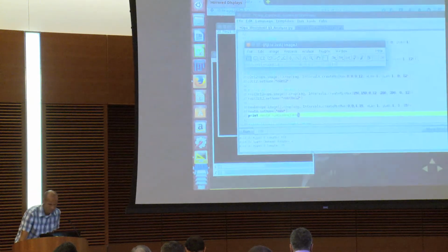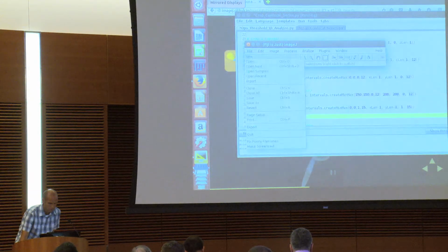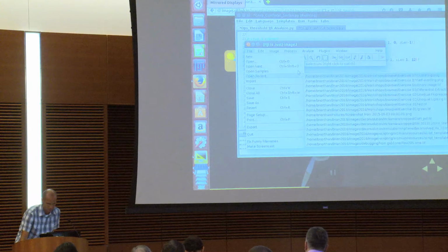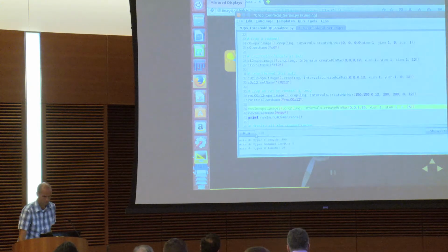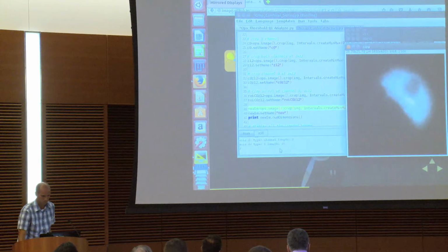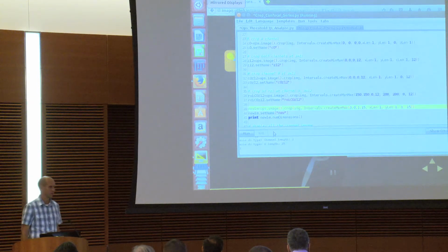This is actually a big topic of the hackathon: lazy ops versus, do you just make a view or do you do some... So it is 2. Yeah. So it did reduce it.